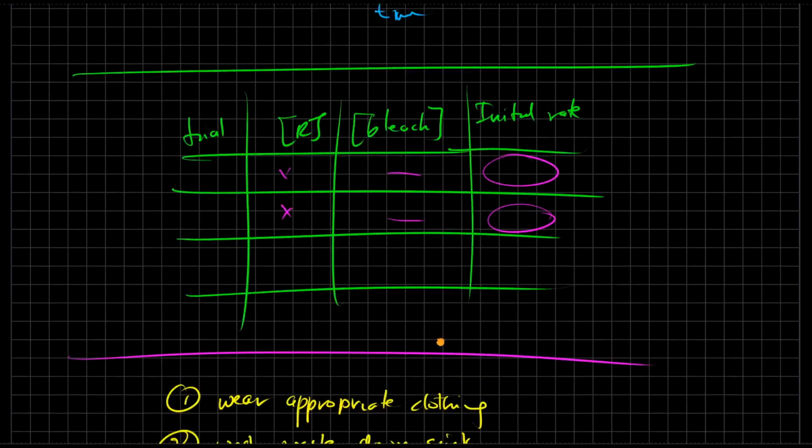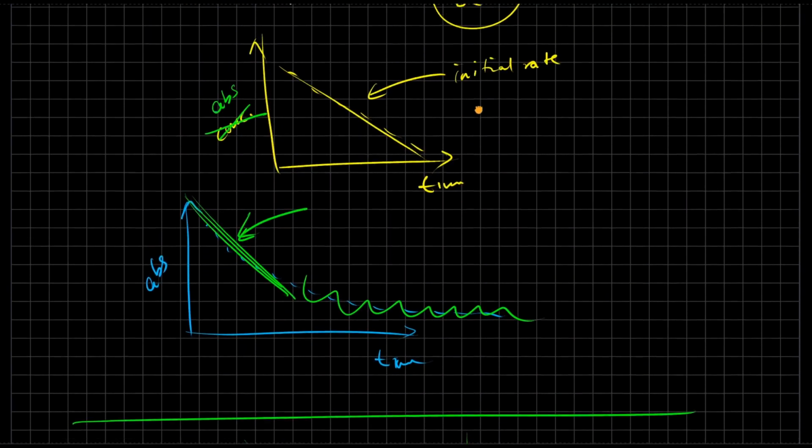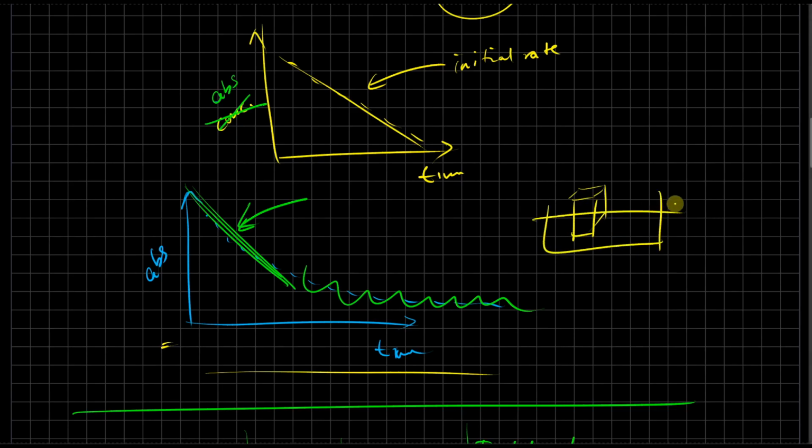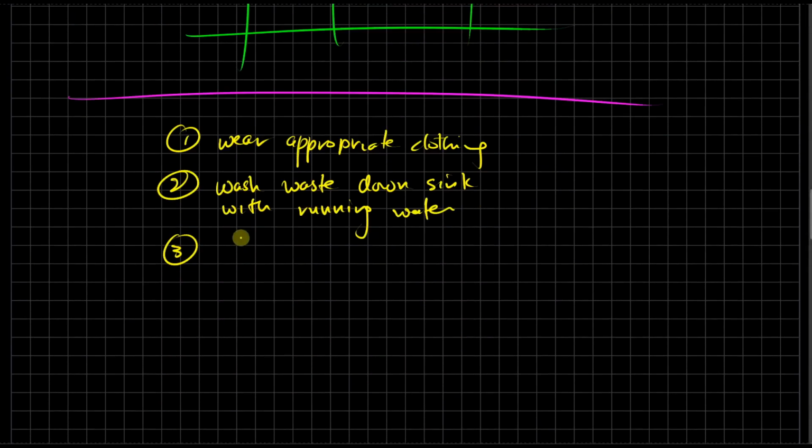Another thing to think about is this is a kinetics reaction that we're measuring absorbance versus time. So being fast is critical, right? If you take too long to put your cuvette into your spectrophotometer, you're going to miss this initial rate part, so you must be fast. So come prepared to read your instructions before, because you'll need to be fast to run the reaction.